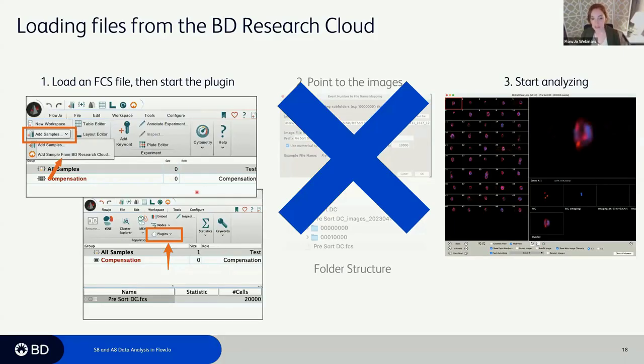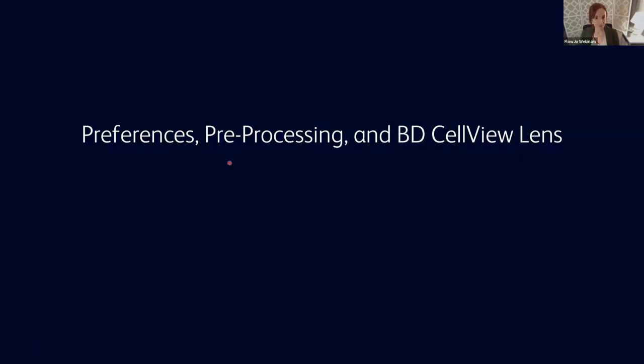So if you have a really large data set, you might experience some lagging, and the seamlessness of the analysis might seem a little slow. I think it's okay for small to moderate sized data sets, but you might see some lagging for larger data sets. But it is an option. It helps keep the data mobile and makes it easy to share the data. So I just wanted to point that out as an option.